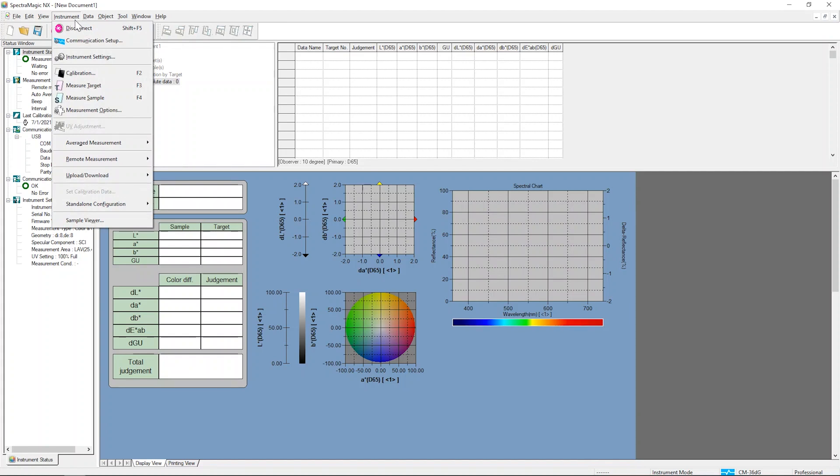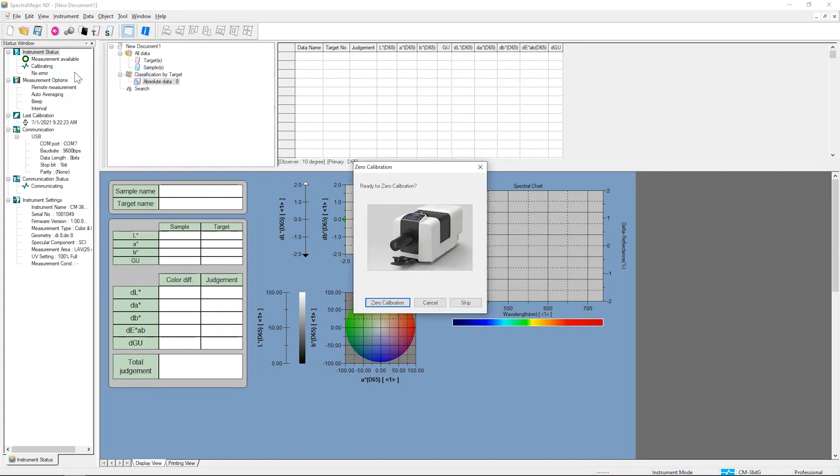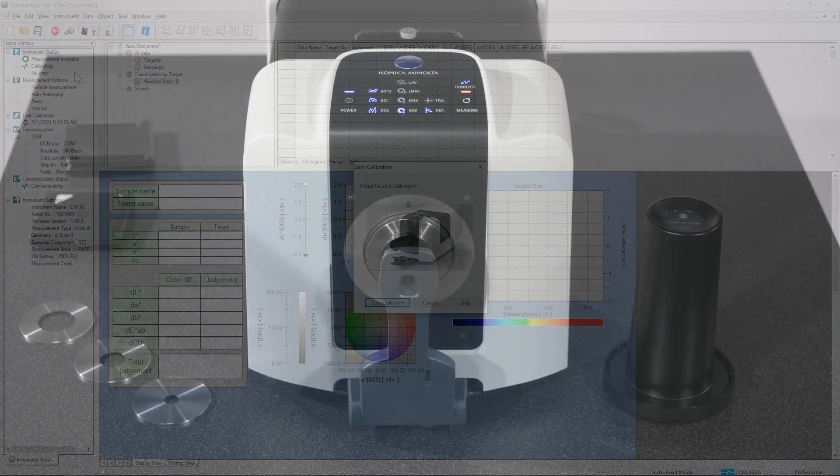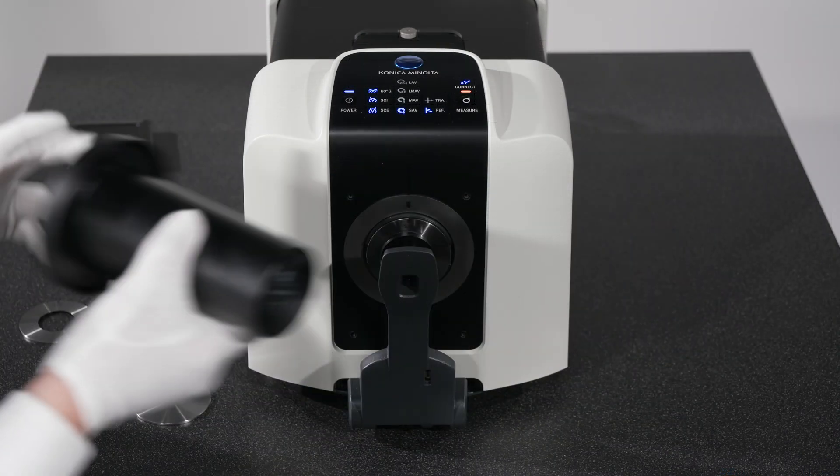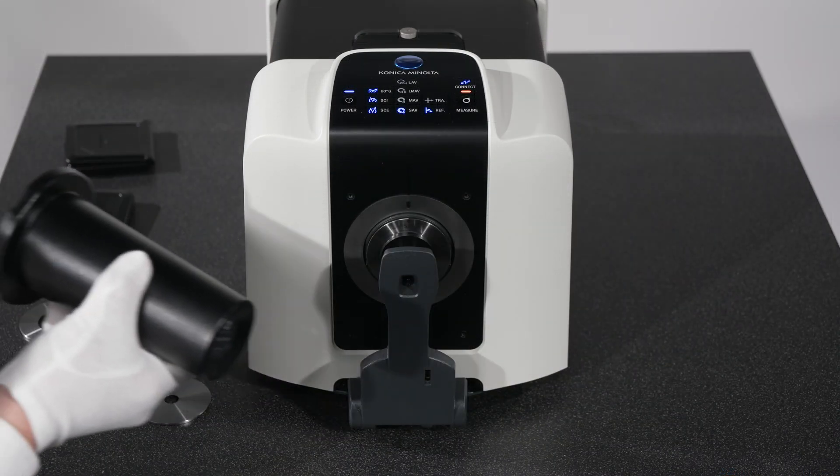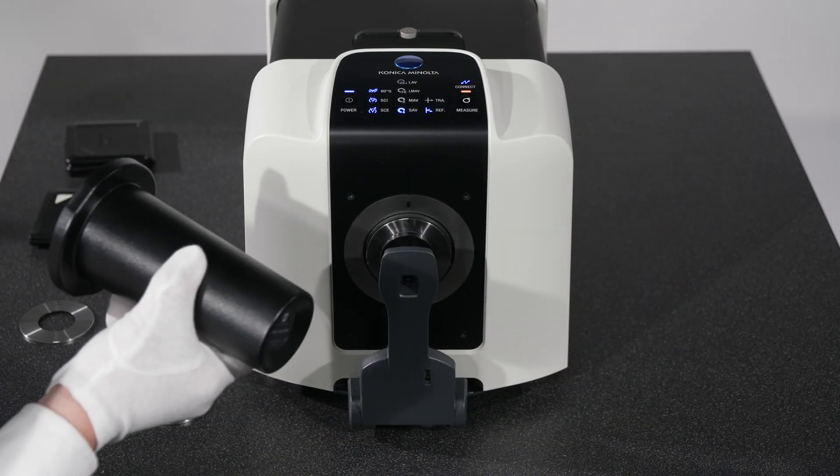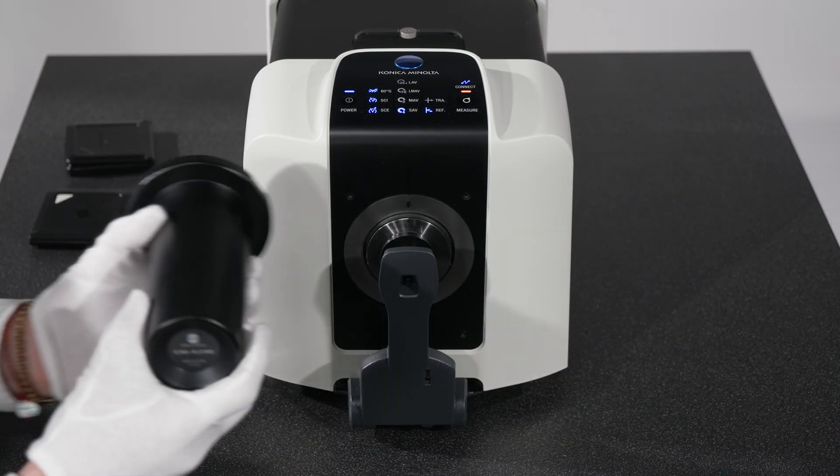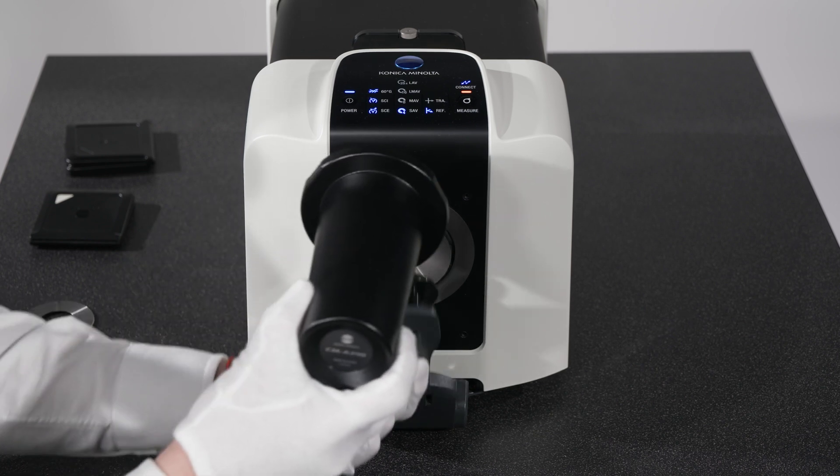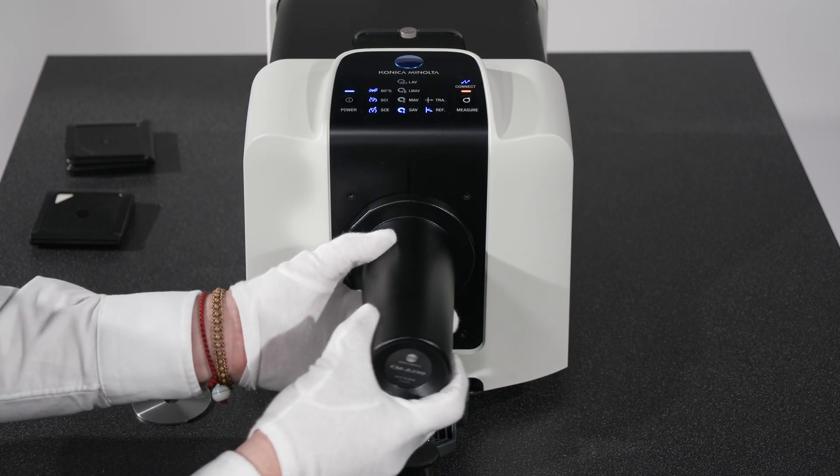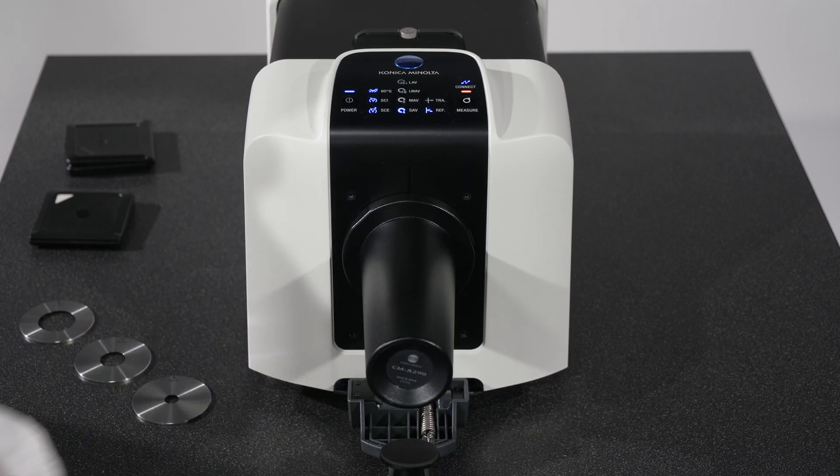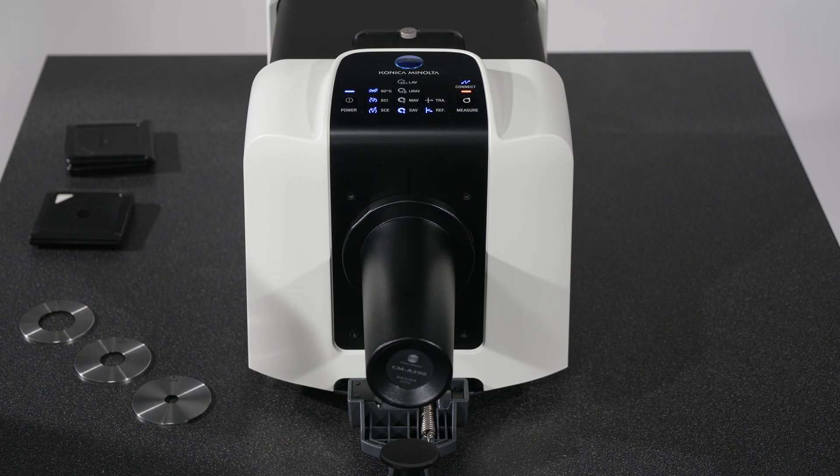Now, calibrate by clicking on Instrument in the top toolbar and in the drop-down list, choose Calibration. This will bring up a dialog box for the type of calibration to be performed. Following the dialog box prompt, attach the Zero Calibration tube and click to start the calibration.